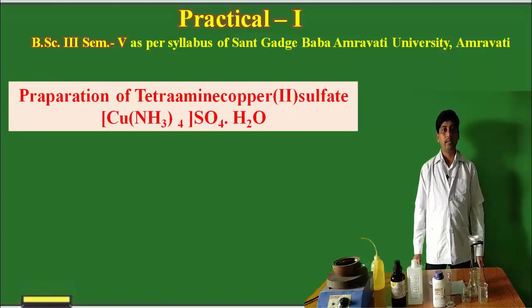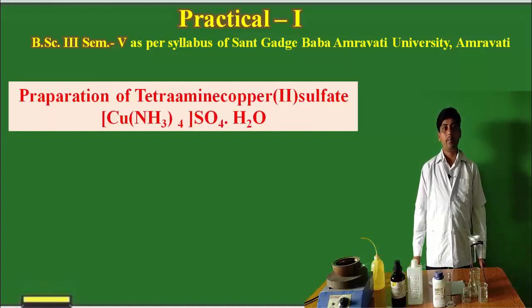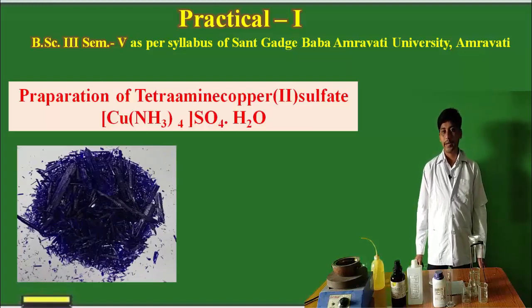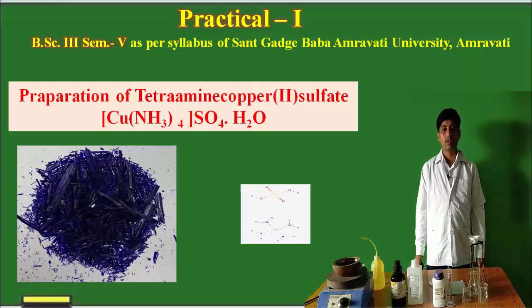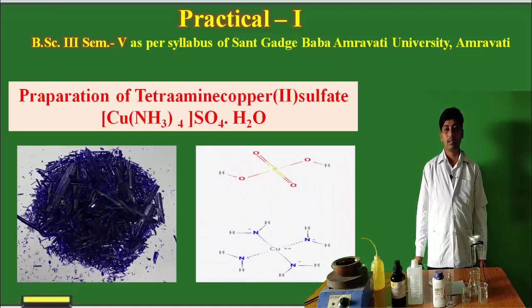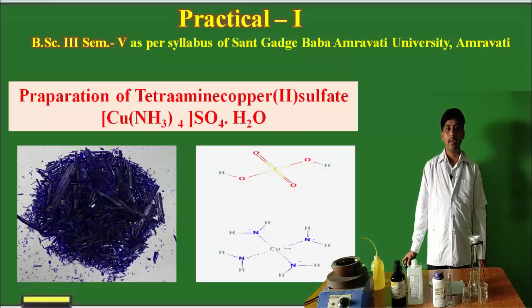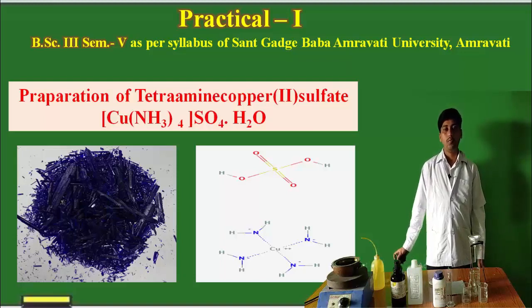Today we will see the practical of preparation of tetramine copper two sulphate. I will now demonstrate the practical — that is, preparation of tetramine copper two sulphate. The copper tetramine sulphate are dark blue coloured crystals. This is the structure of copper tetramine sulphate complex. Now we will see the demonstration of how we will prepare this tetramine copper sulphate.